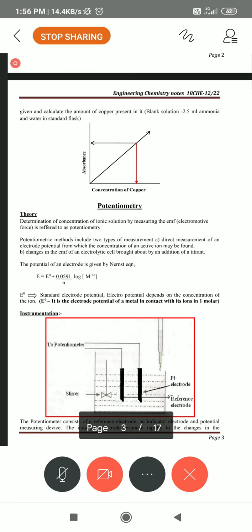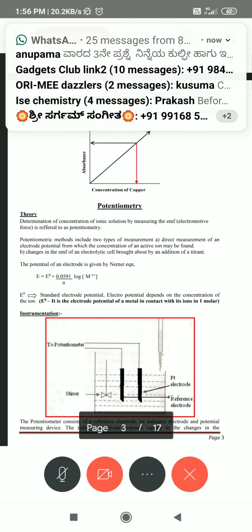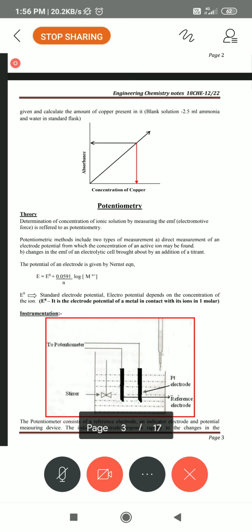Based on the thickness, it can estimate how much salt is dissolved in a given sample. For that you don't need analysis of the complete salt; instead, for very accurate quantitative estimation of how much salt, we use this instrument, which we call a colorimeter.